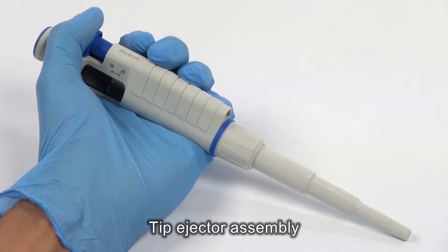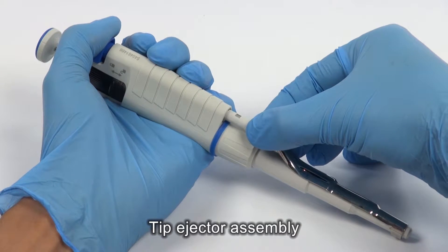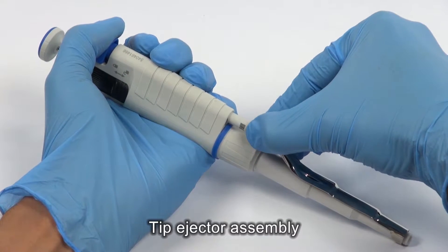Press the tip ejector button. Push the tip ejector on the arbor. Turn it right until it is latched.